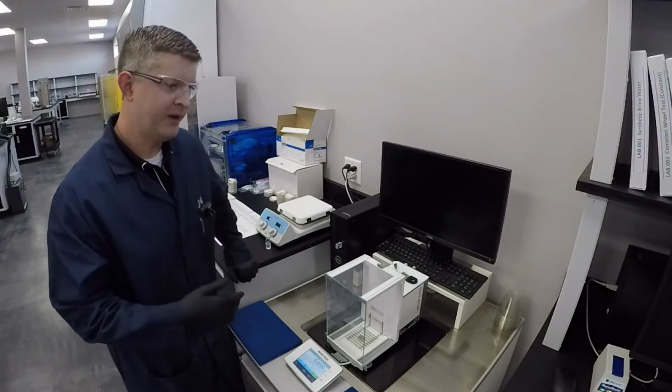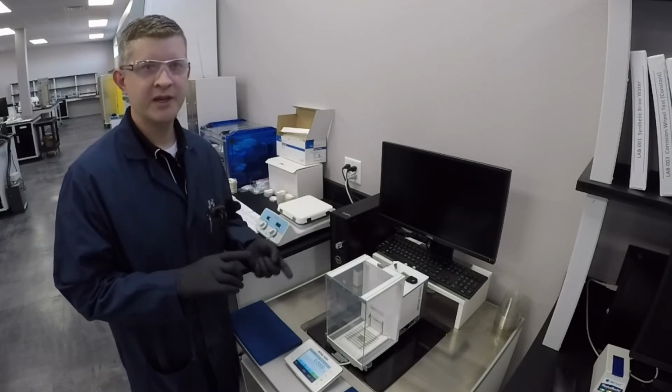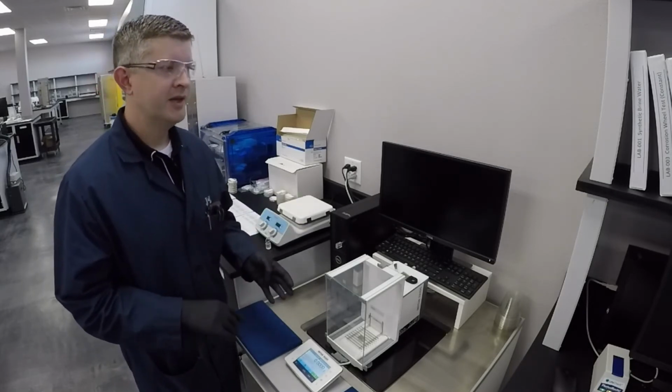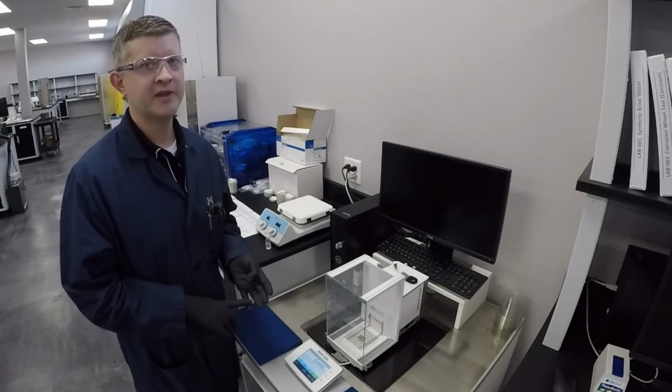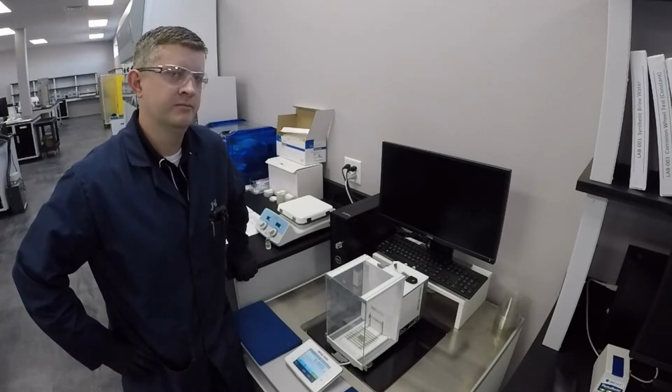Yeah. Here at J&L, after we give you those 4 components, you get your percent hydrocarbons, percent carbonates, percent iron compounds, and percent acid insolubles. If the customer wants to know what the acid insolubles are, we can't help them out. Really? Just kidding. XRF. All right, well, I'm going to go learn about the XRF scan. It will tell us the components. Yeah, go see Hector. He'll help you out.